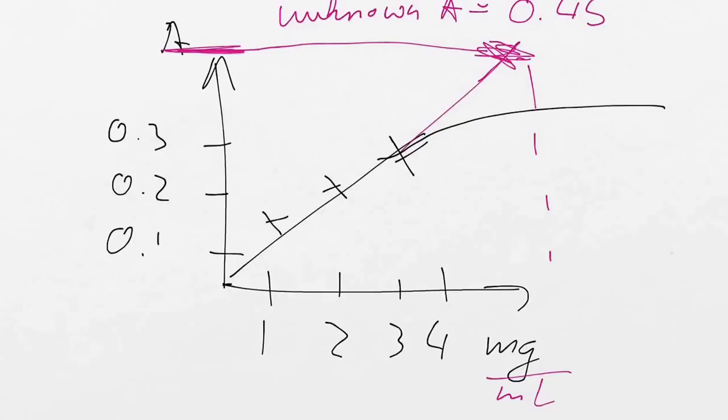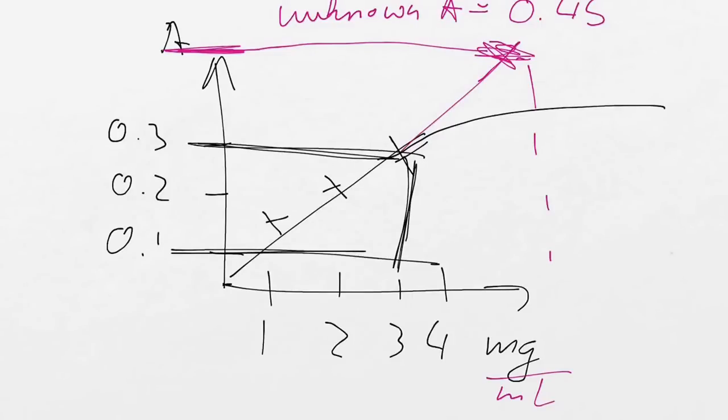You can only measure data which are within your measured range. Never outside. This would be abuse of a standard line. Does that make sense?